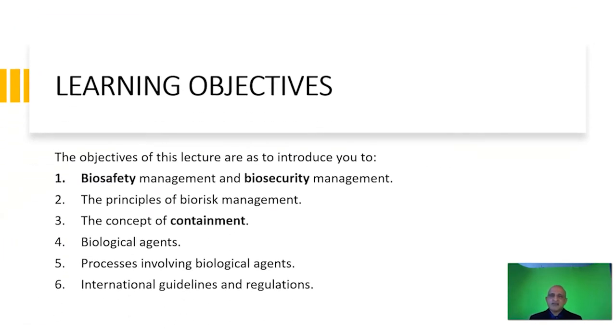Each of these lectures has very specific learning objectives and specific learning outcomes. These are your learning objectives for the current lecture. The first one is to introduce you to the basic principle, which is biosafety management and biosecurity management. Then we move on to the principles of biorisk management, the concept of containment. This will be our first concept. Then a brief introduction to biological agents, which I will expand upon in the next lecture. There are specific processes involving biological agents, which I will discuss, as well as the international guidelines and regulations. Everything which is introduced to you in this lecture will be expanded upon in the subsequent lectures.